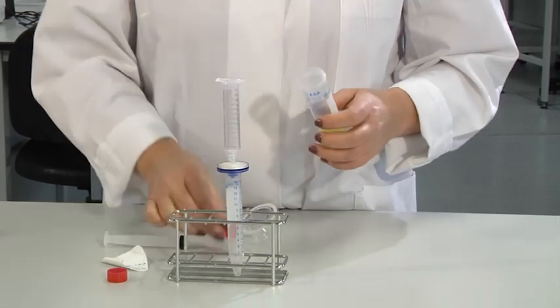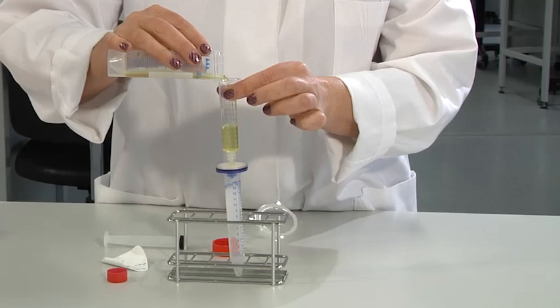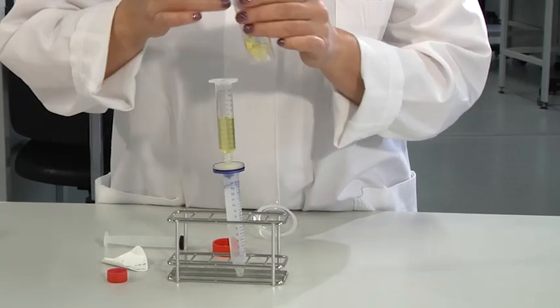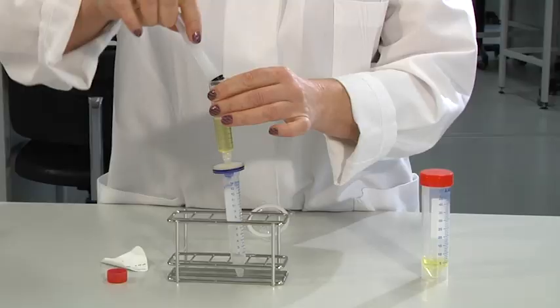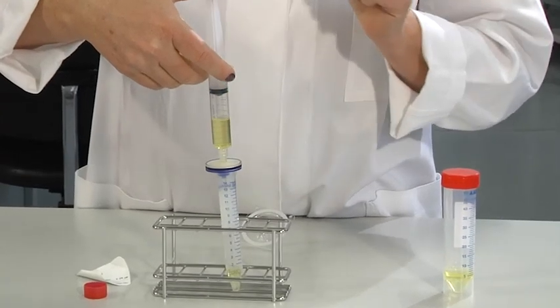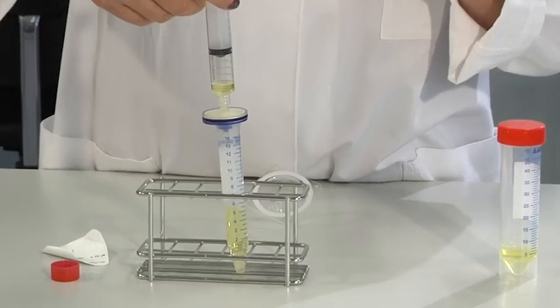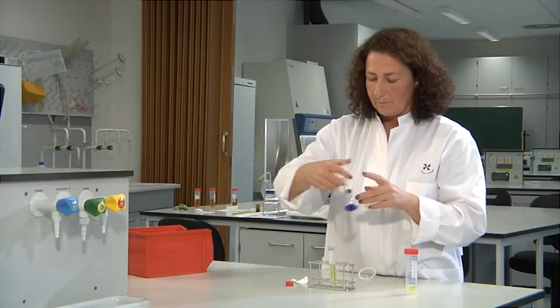Then put the filter over the opening of a sterile tube. Finally, fill the syringe with the stock solution of the compound, for example a heat labile vitamin. Gently push the plunger. By doing this, the solution is filtered and now may be added to the medium.